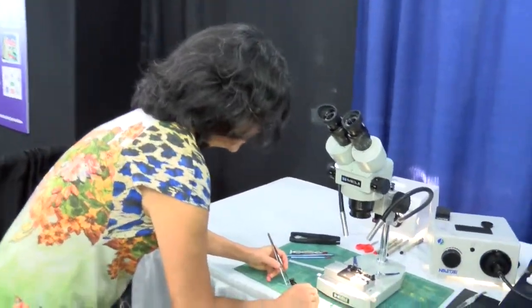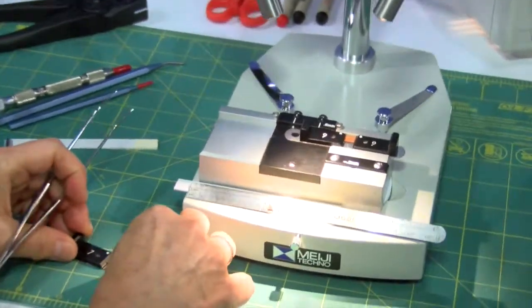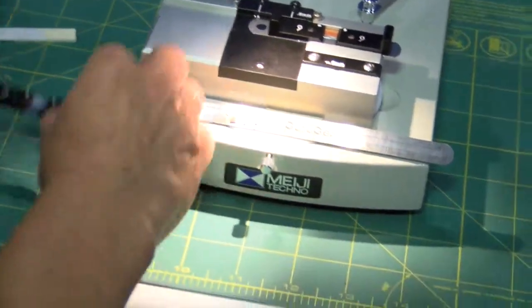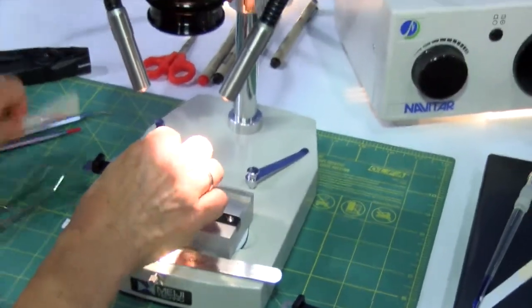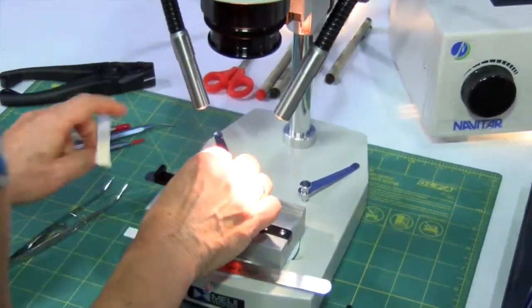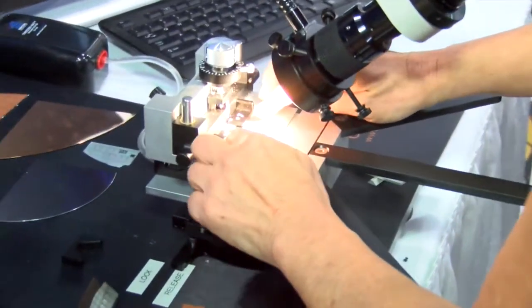I'm going to now explain. First Janet is going to put the sample on the hold downs and align the front end of the sample to the edge getting ready for indentation on the LatticeX.